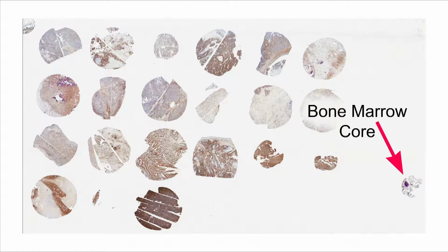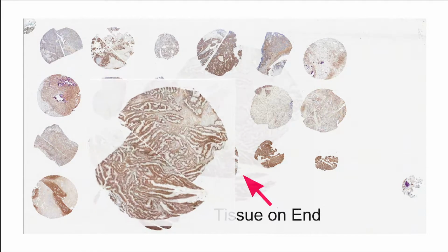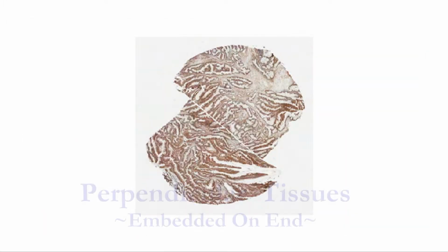The bone marrow on the bottom right corner was added to the slide after because we didn't want to use a bone marrow in this TMA block. That is actually a bone marrow sausage core. This sample was cut in half and embedded on end.